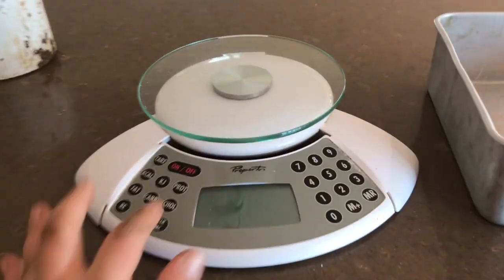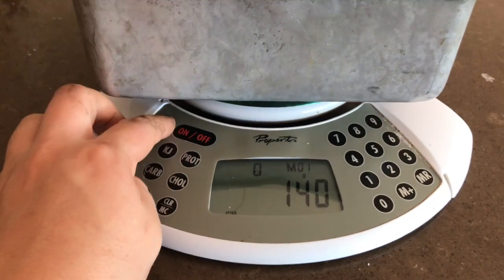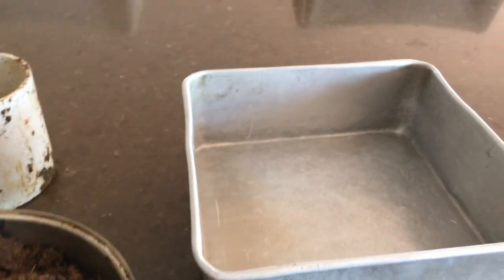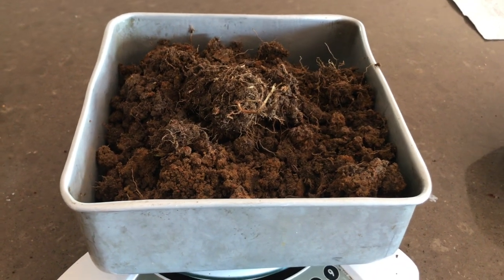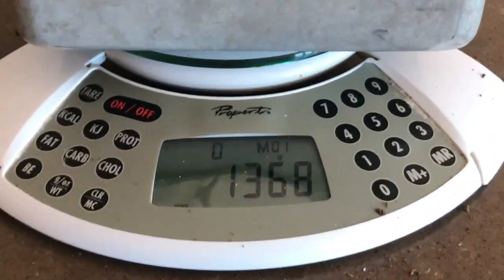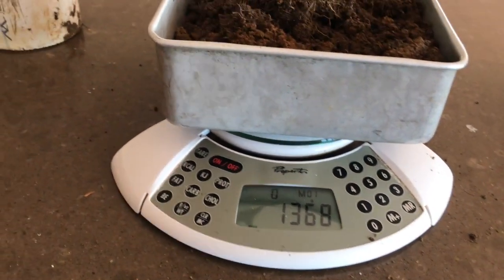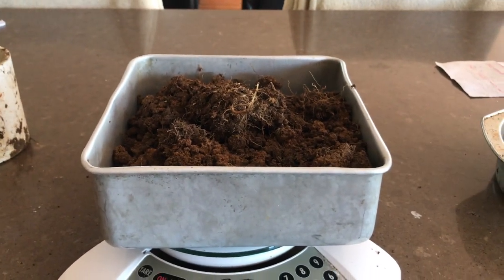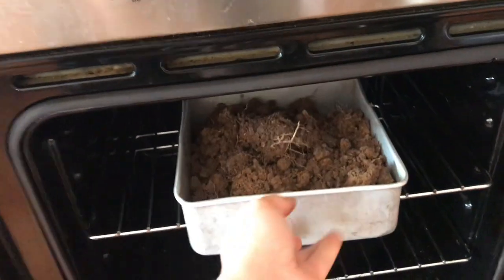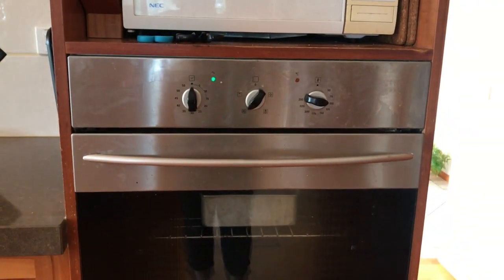So we come over here, turn our scales on, put our empty cake tray on, and press tare, setting it to 0. Next we're going to put our soil sample into the cake tray, and we're going to weigh it as so. Now we can see here on the scales, it weighs a total of 1.368 kilos before it goes in the oven. So now all we'll have to do is bake it and then weigh it afterwards. There it goes. We'll let that cook and check back soon.